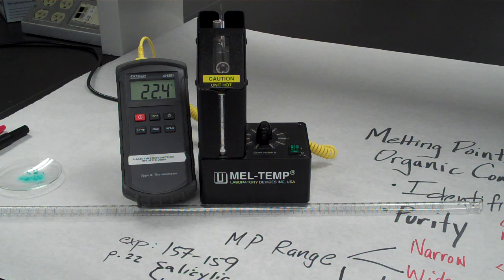Right? So melting points are a pretty vital part of work in organic chemistry. Anytime you make a new compound, it's one of the classic things that you do would be to first conduct a melting point analysis and compare it to a known sample to hopefully confirm a successful synthesis.